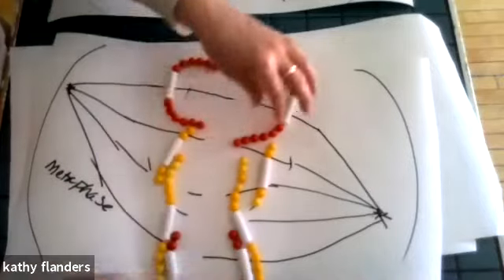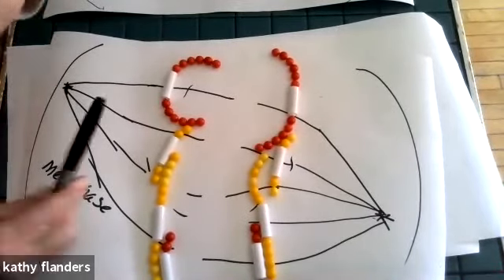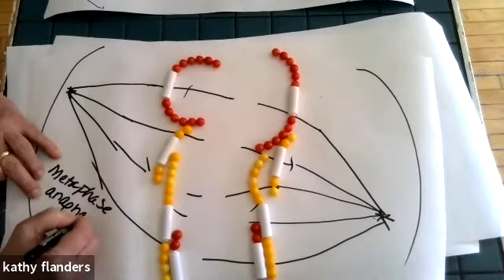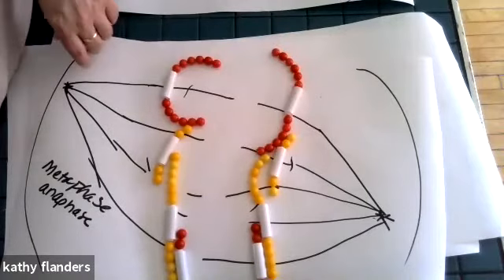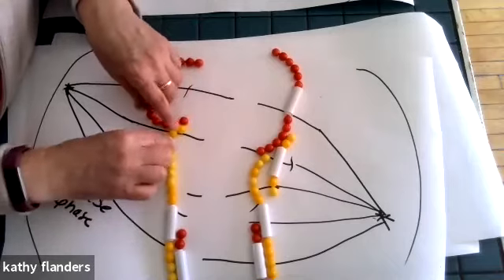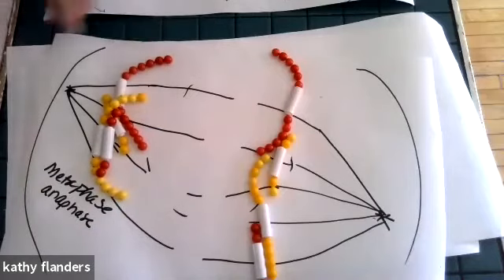Okay. And as soon as those start to separate from one another, that's called anaphase. There is anaphase. So these are going to pull apart, and they are going to pull up toward our centrioles.